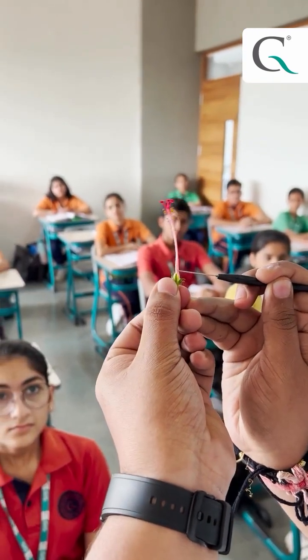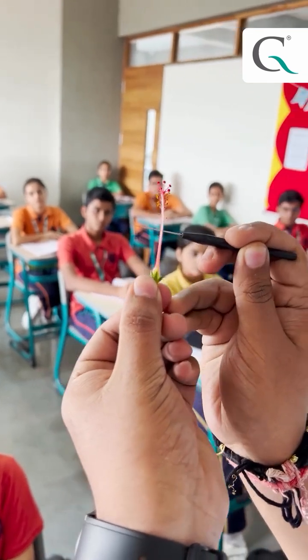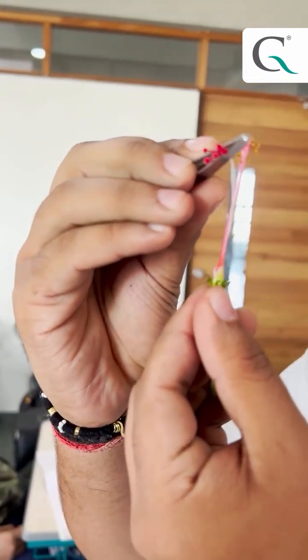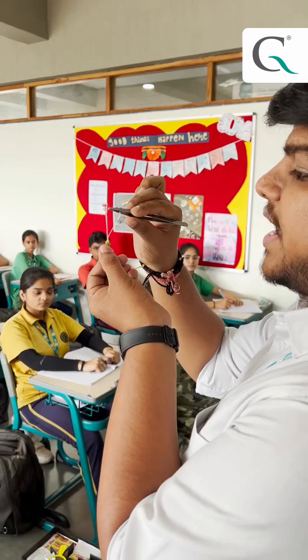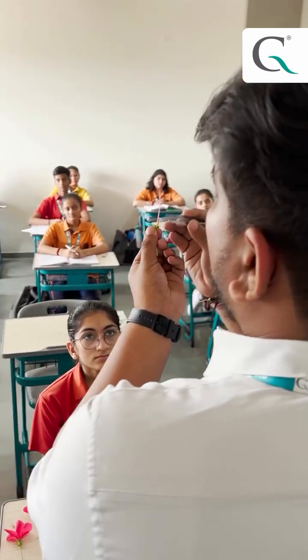This part is the pistil — the female part which is known as the gynoecium. This one is basically known as the stigma, which is the platform for your pollen grain. The thread-like structure is the style, which helps to migrate the pollen tube towards the ovary.